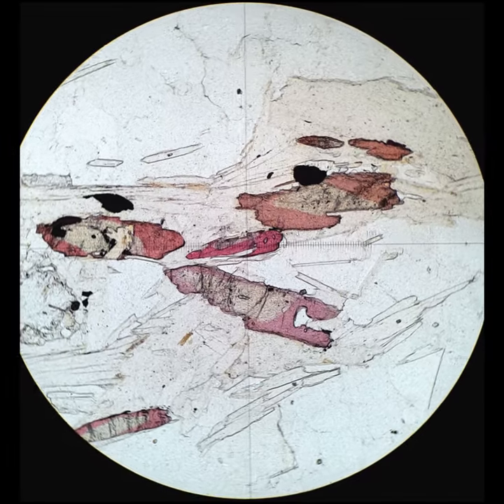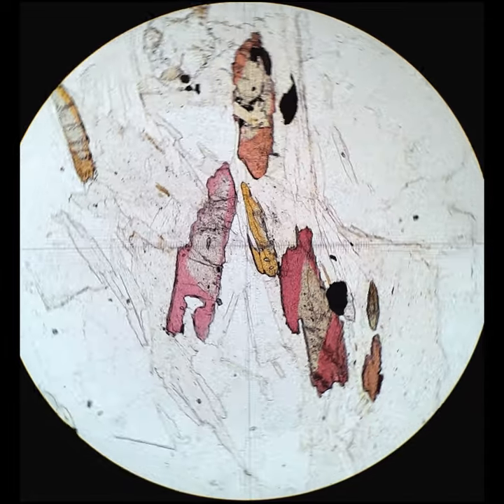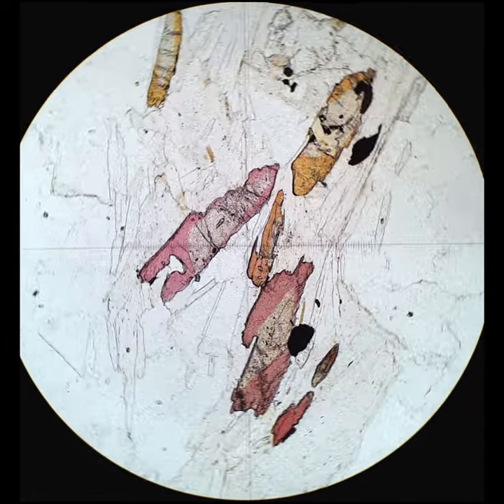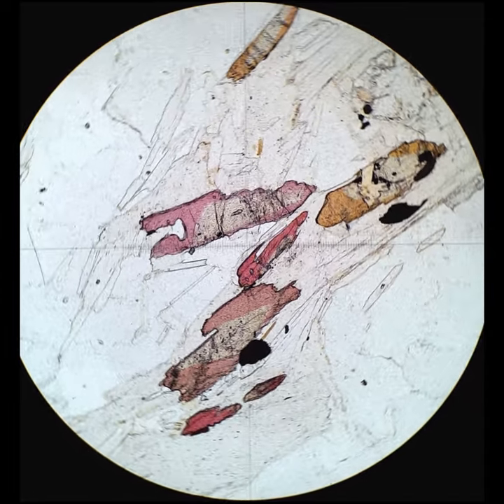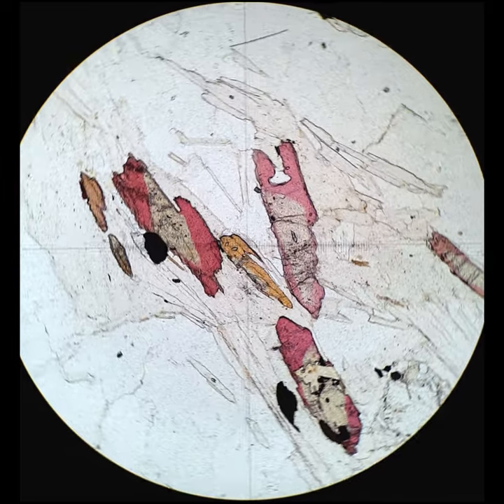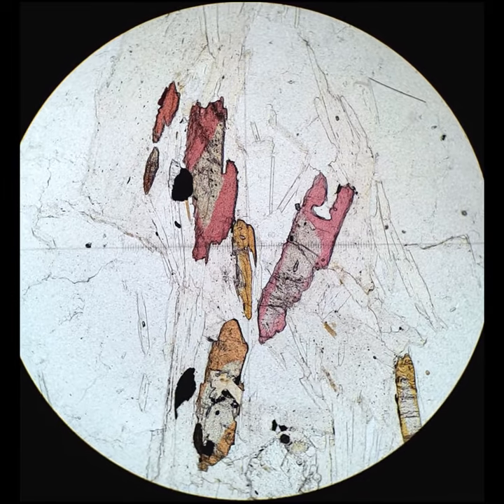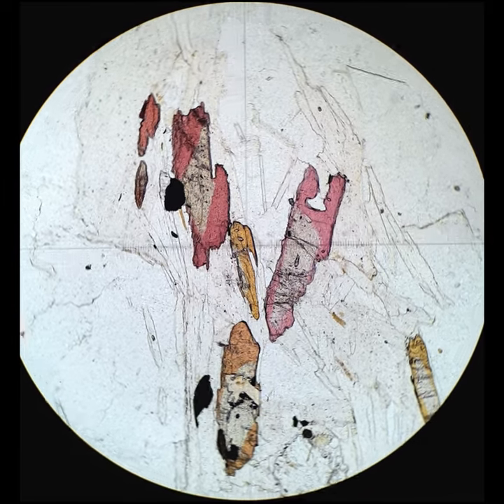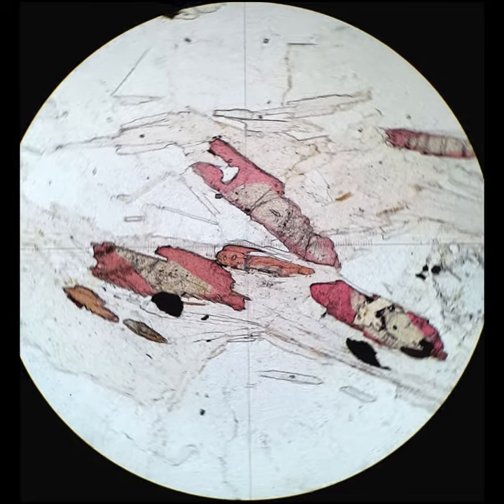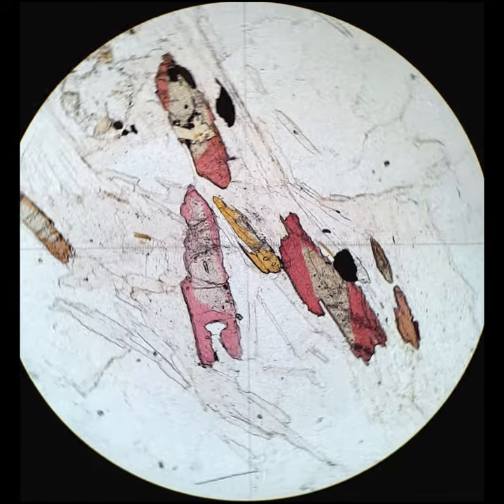One last example of color zoning — this is epidote group minerals. The core has low manganese, while the rims that are distinctly pink and orange have high manganese. And so that's a chemical zoning that manifests itself as pleochroic differences.